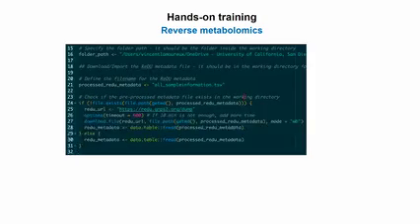So I know it's a lot of manipulation, right? But when you get used to it, all this workflow of going to the GNPS library, checking your molecule, doing the fast search, and running the script, it's a matter of like 2 minutes, basically. So when you get used to it, it's super fast. I just know it's a lot of information to process, but usually we do that constantly, right? And it takes less than 2 minutes to do this whole workflow. So it's normal that it's taking time now.